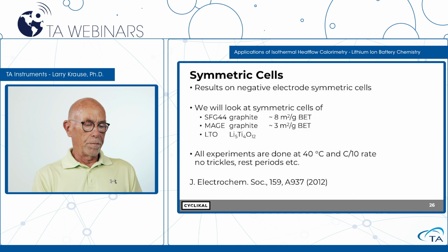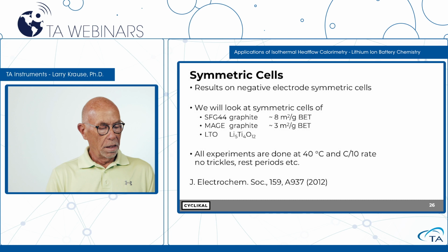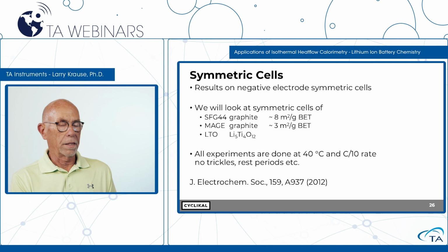And what I'm going to talk about are symmetric cells of three different materials. These two materials are graphite. This is a synthetic flake graphite, SFG44. It's a 44 micron flake graphite, and it has a surface area measured by BET of 8 square meters per gram. And another type of artificial graphite, MAGE, I think stands for massively active graphitic electrode. It's another graphite electrode, but it has much smaller surface area, 3 square meters per gram.